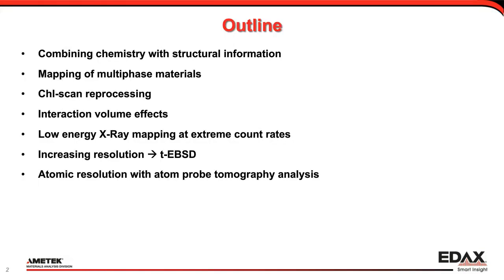This is a short outline of the talk. First, what can you actually do with combined EDS EBSD data? It is often claimed that it's only useful to distinguish phases with similar crystal structures or EBSD patterns. But there are some more instances where having EDS information available can be a great help.